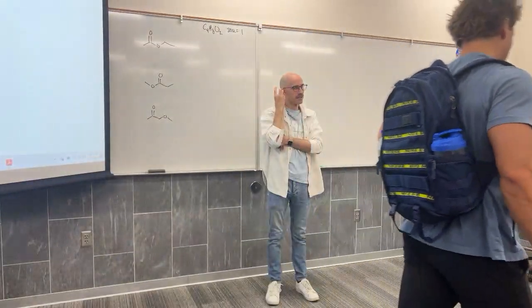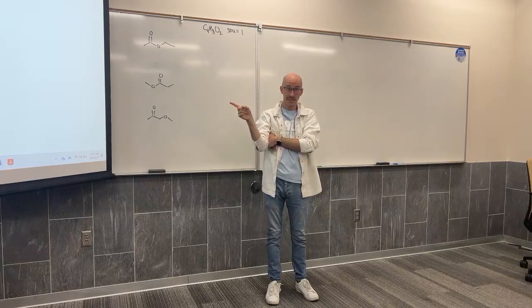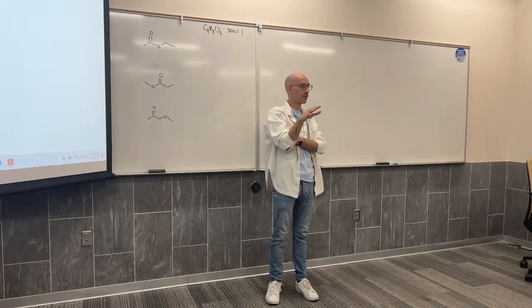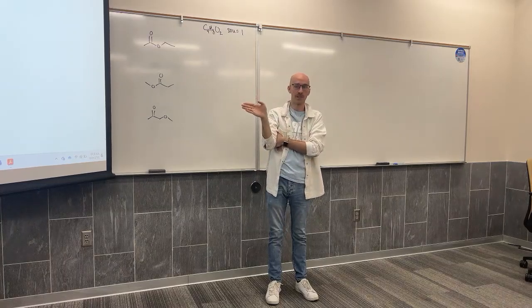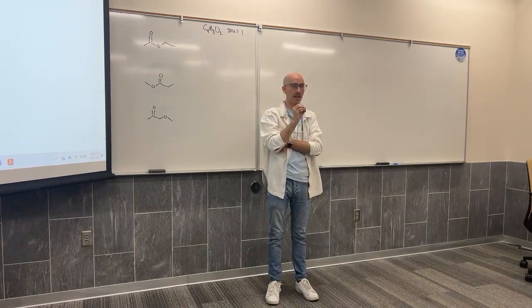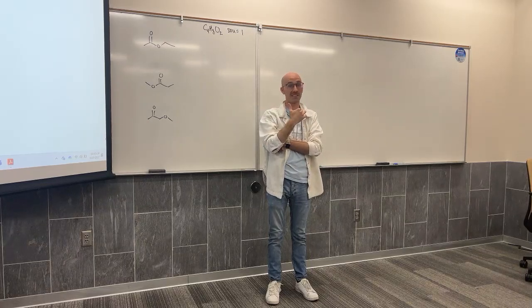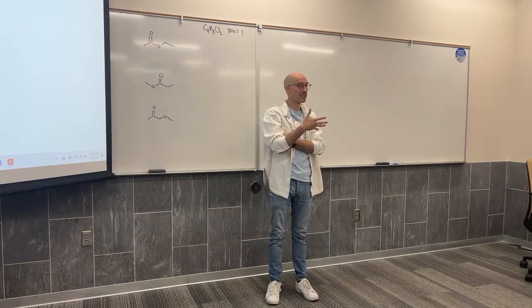And the last part is the splitting pattern. Now this is an NMR example with a very clean splitting pattern. Those of you that took the lab this week or have lab tonight, you looked at NMR spectra with very clean splitting patterns. But a lot of the experimental spectra that I give you on unit tests and exams, their splitting patterns are messy, they're challenging to read.